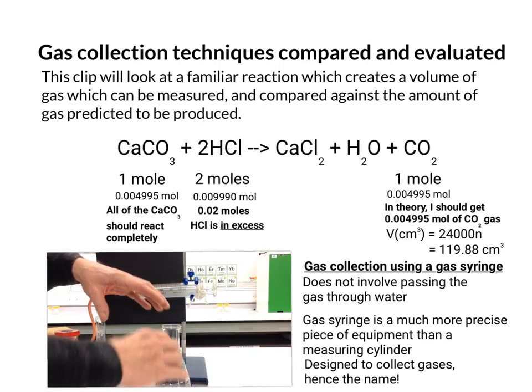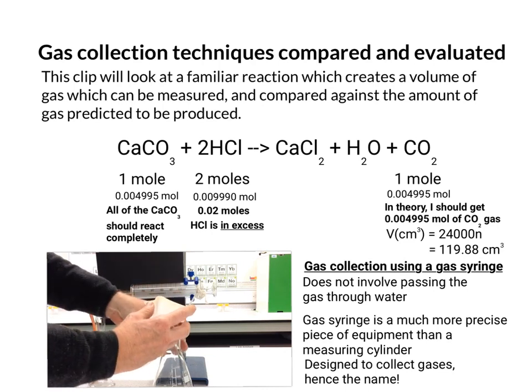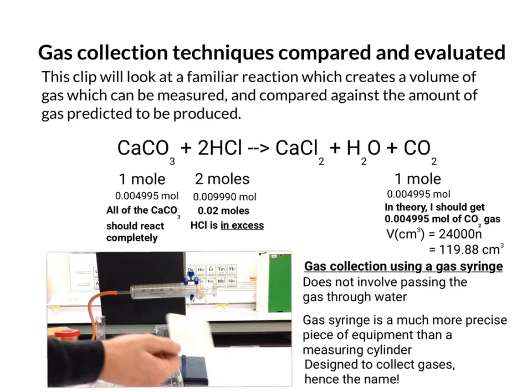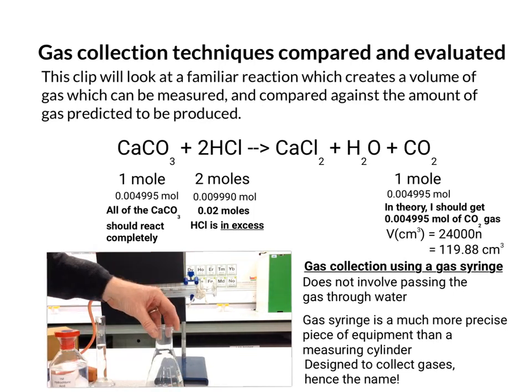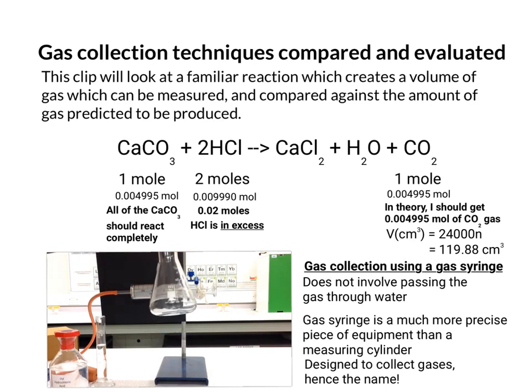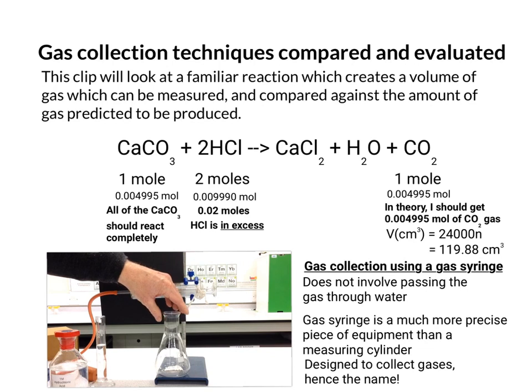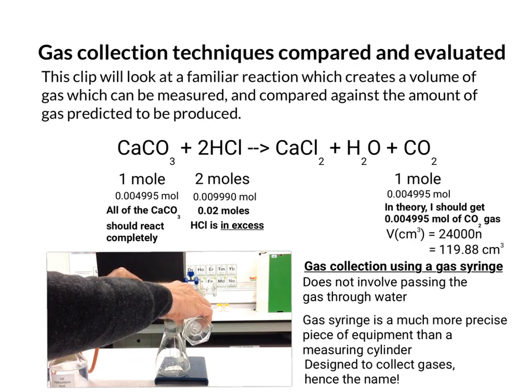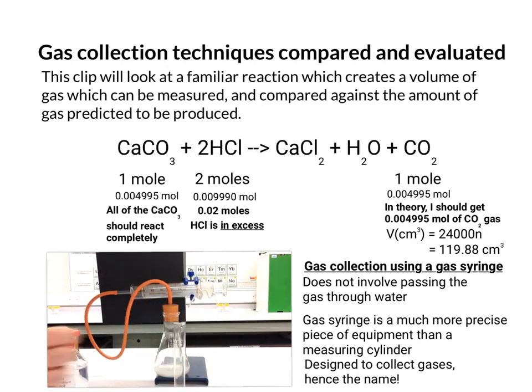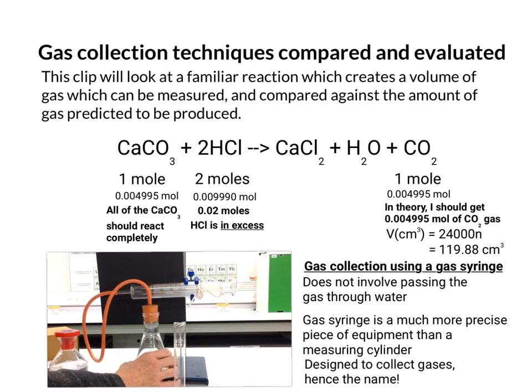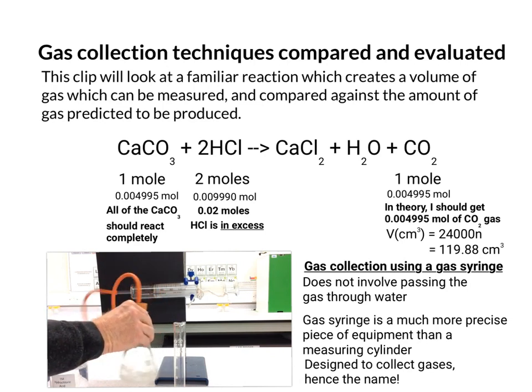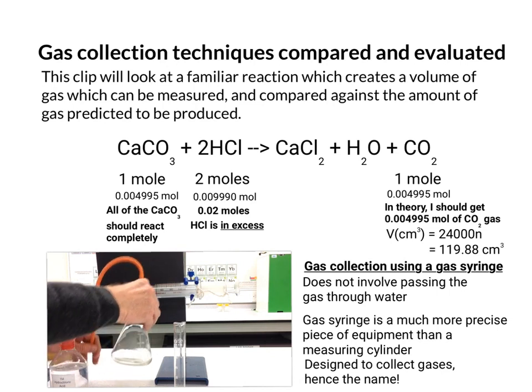So again I'm going to put my sample into the flask. Tapping it to make sure as much goes in as possible. So you can see it's in there. Pop it on a dark surface so you can see clearly the white powder. Again, pop the acid in. Quickly replace the bung and you can see the gas syringe start to move. So obviously the pressure of the gas is pushing the gas into the gas syringe. Shaking the flask as much as I can to encourage as much gas as possible to find its way into the gas syringe.